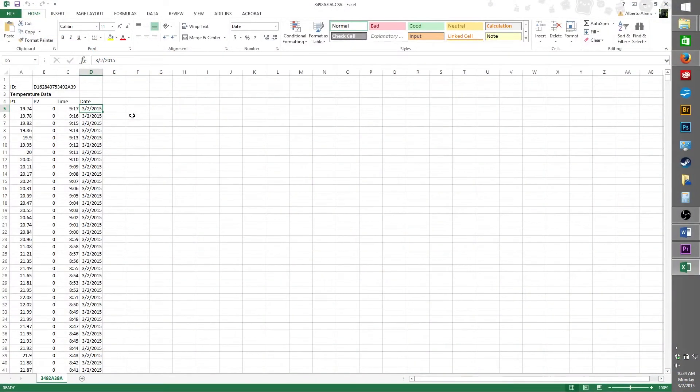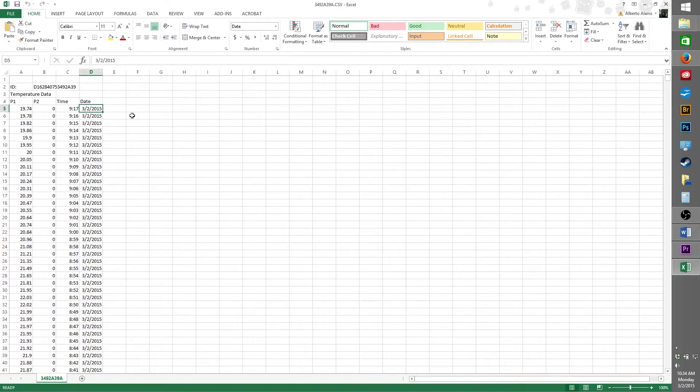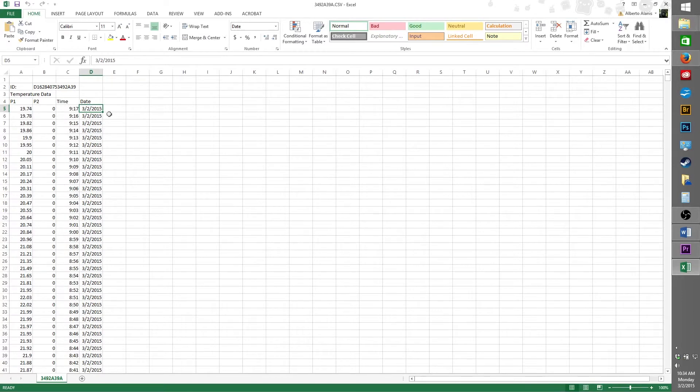Once you have your spreadsheet open, you'll see four columns of data. P1 and P2 represent the probes connected to your excursion track at the time of the recording. In this case, I only had one probe connected to my excursion track, and it was connected in the P1 slot. Time indicates what time it was in military time when your excursion track thermometer stored the temperature reading. And date indicates the month, day, and year in that order that the temperature reading was stored. For example, my last reading was March the 2nd, 2015.